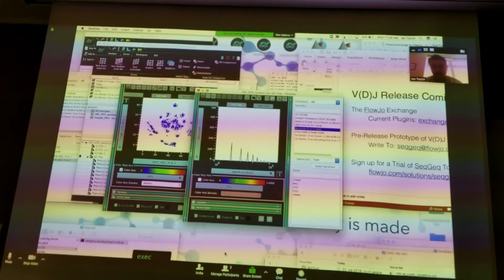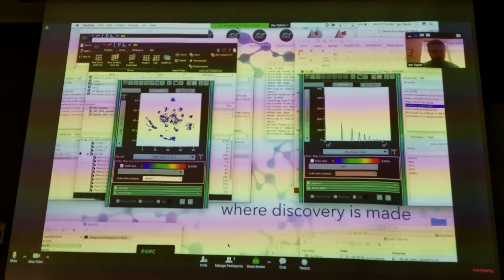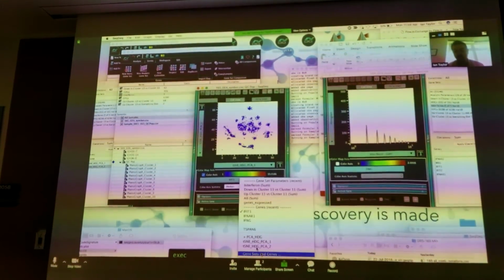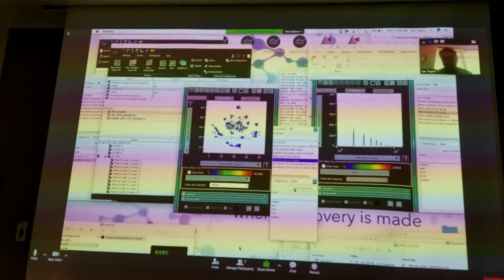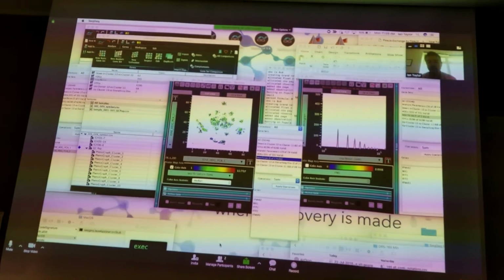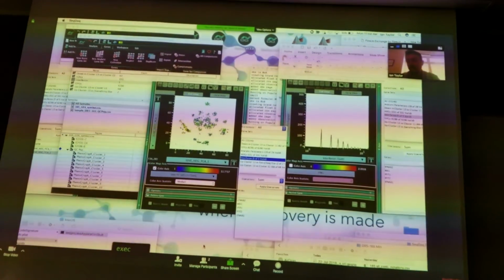You'll notice the color map scale is going to match up with the scale that we use here. And now if I wanted to color by the sum of those genes' expression, I can choose this one. Okay, so now we can really clearly see that this island is lighting up with more expression in total for those 5 genes that we've added to this particular gene set.